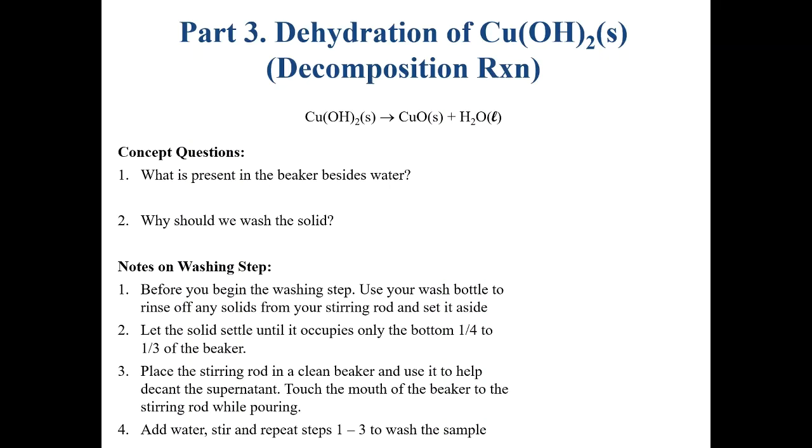Now, I have a couple of notes here on how to wash the solid. The most important thing for you guys to do is to just watch the video. They don't go through as much of a careful process as we would have in the video, but these would be some things that you would do if you were doing it in our lab.